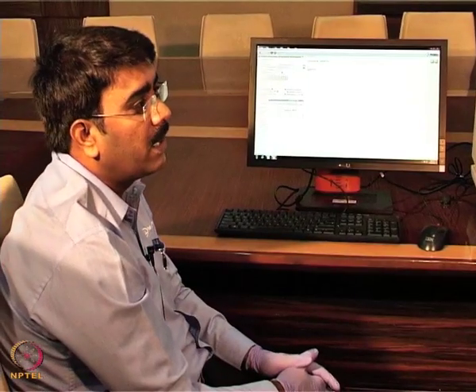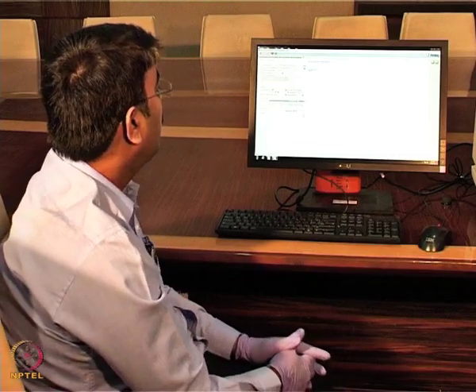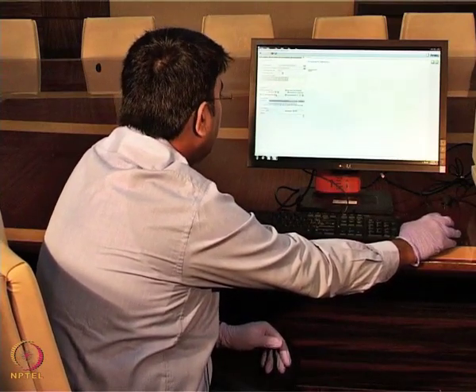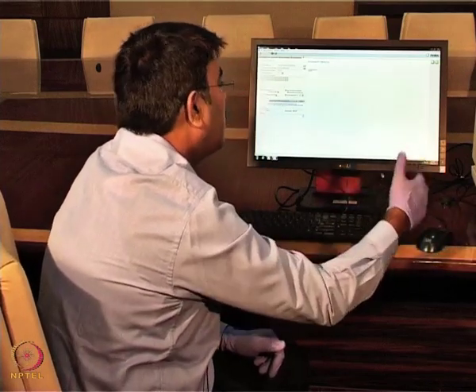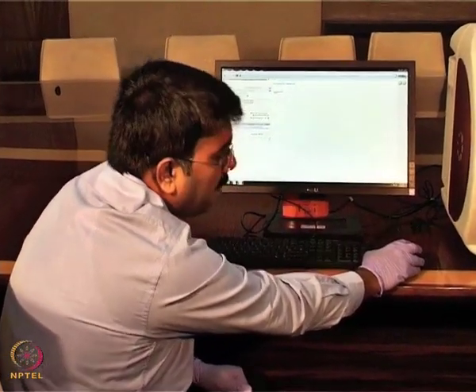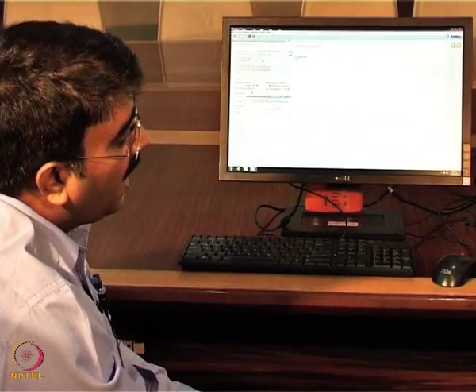Whenever you are performing the experiment, sensors have to be hydrated prior to the experiment. At least 10 minutes is required for the hydration. Suppose your sensors are not hydrated, we can set a delay of 600 seconds in the software; 600 seconds is nothing but 10 minutes. After the hydration, the instrument starts acquisition. The second option is whether your sample has to be in shaking conditions during the hydration, because the instrument has a shaker, it will mix effectively.